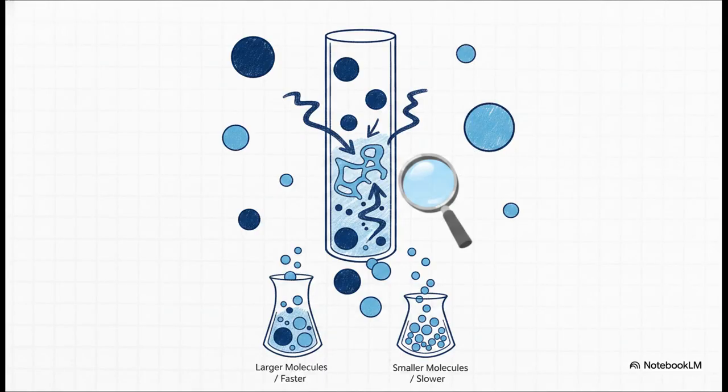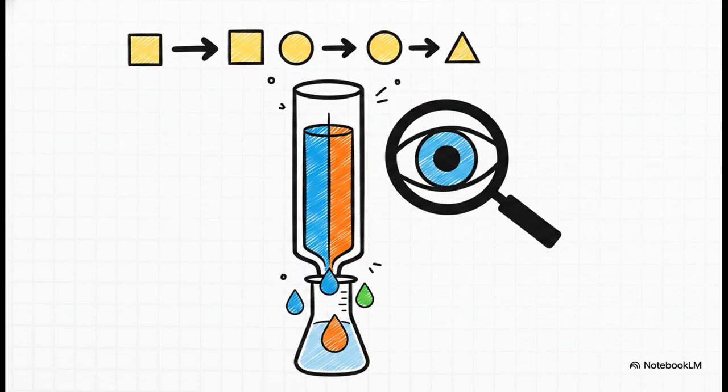And that brings us to the formal name for what we're talking about: size exclusion chromatography, or SEC. It's defined as a separation process where migration velocity depends on molecular size, causing the larger molecules to elute, or exit, the column faster than the smaller ones. Because of this really unique size advantage, SEC is an irreplaceable tool for analyzing natural or synthetic macromolecules. Now, it's not the most efficient process if you're trying to separate tiny intermediate molecules, but if you need to separate compounds with vastly different masses, like, say, stripping small contaminants out of a giant protein, SEC is absolutely the tool for the job.